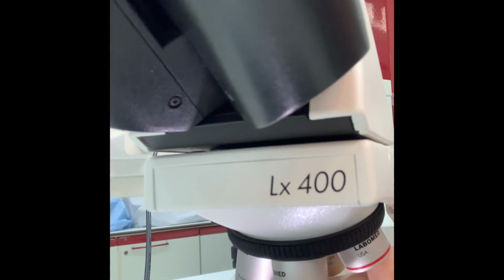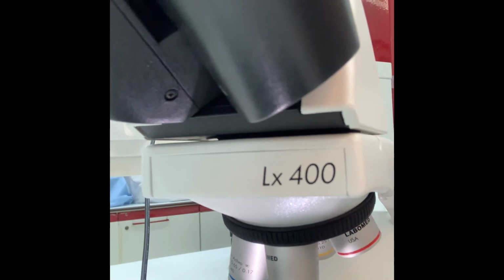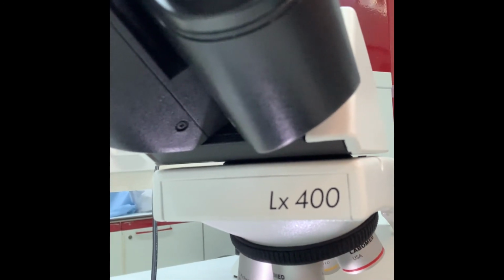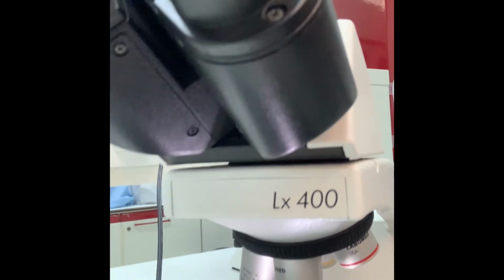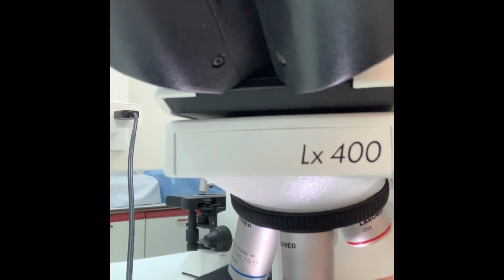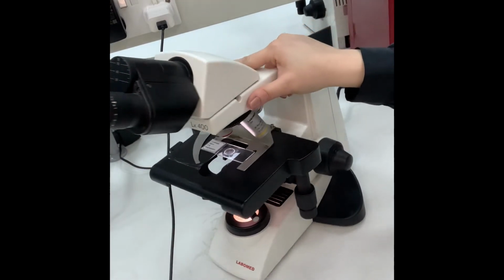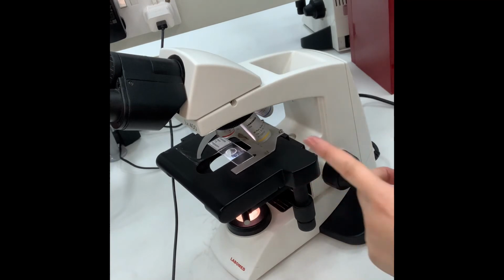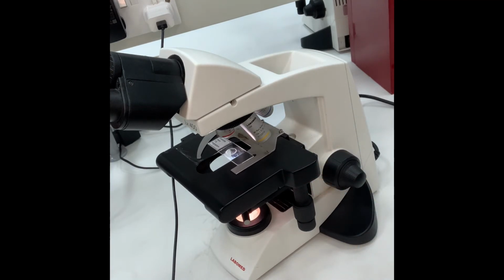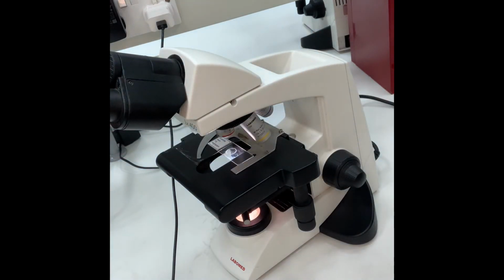See, I won't go any further. I need to add a drop of oil. It is called oil immersion, to avoid breaking the slide because it will cause friction. So the oil immersion is to facilitate the movement of objective 100. That's it. Now I know it is hard for you to understand without looking at the microscope and working with your own hands. I hope I actually clarified how to use the objectives and the body parts of the microscope.